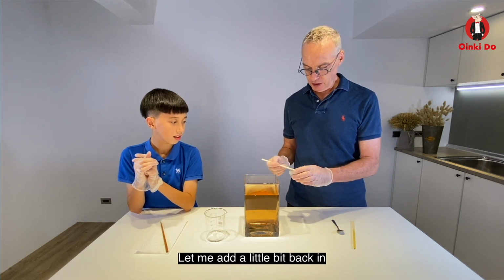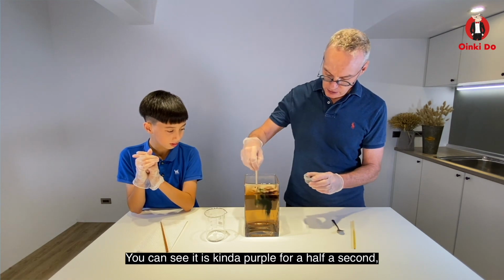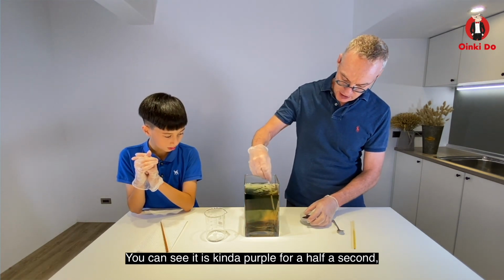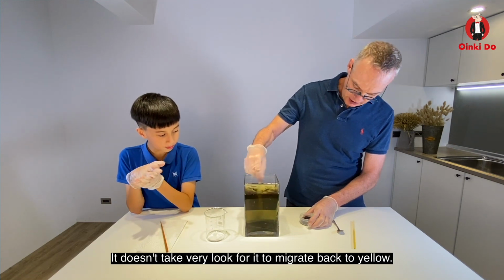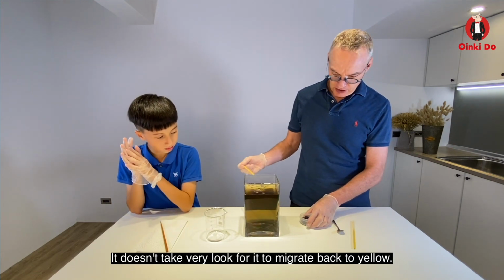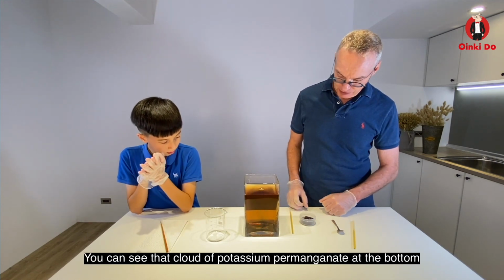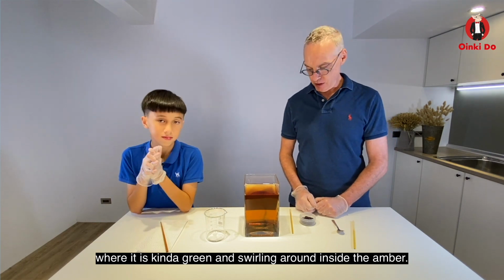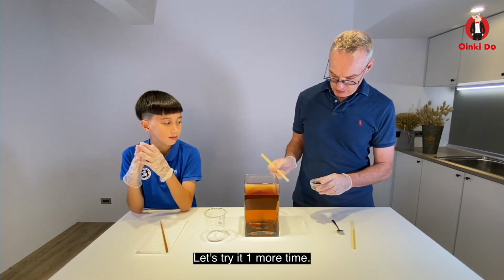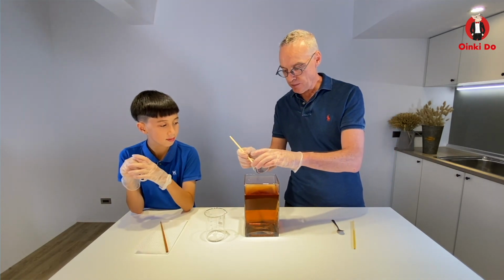So let me add a little bit back in. And yeah, you can see it's kind of purple for half a second, and then it's trying to get back to the green. It doesn't seem to take very long for it to migrate back to yellow again. You can see that cloud of potassium permanganate in the bottom where it's kind of green, swirling around inside of the amber. All right, let's try it one more time. That's quite a beautiful color there. Let's see what happens if we add some more.